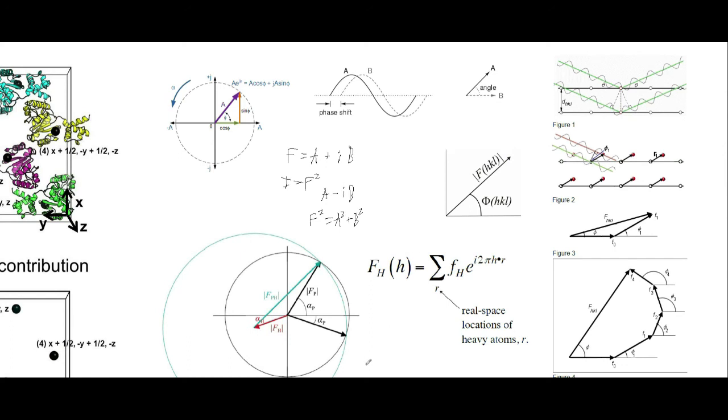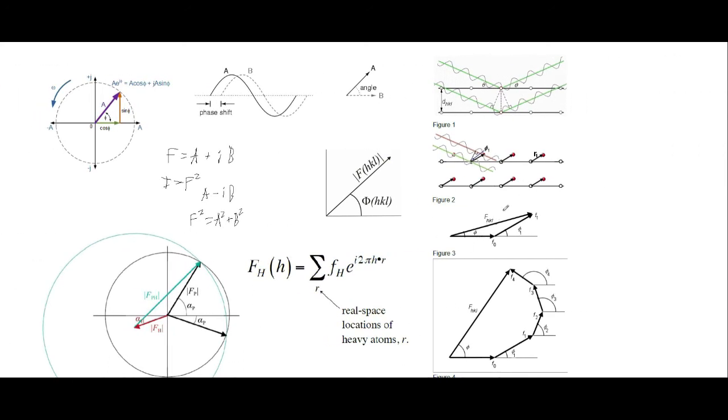And so we see over here that our structure factor, so if we have a reflection off of this plane here, and then we have another plane of atoms that have this vector away from our plane here, so they have a plane like this, we're going to have reflections off of this plane as well, and that's going to create a phase difference between the two planes.